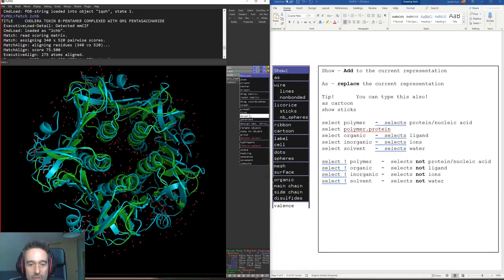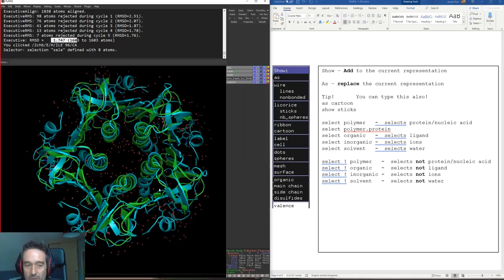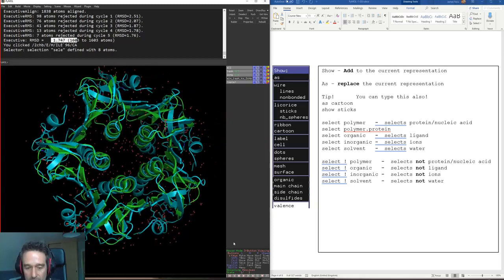There are a bunch of other different things in the action menu. For example, you can rename stuff, you can delete things, you can make copies of, and you can extract parts if you've made a selection. You can extract that selection to make that into a different object, which can be very, very useful, because that then allows, for example, I'll just show this.